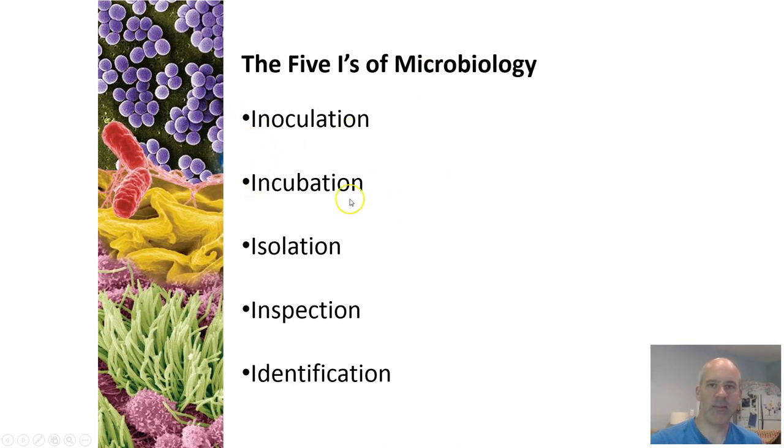Incubation. So you guys know what incubate means. You put it into some environment that's going to be with a proper temperature for that microorganism to grow. Then isolation. If you think about it, if you swabbed the inside of your mouth, there are going to be lots and lots of different types of microorganisms there. And isolation means you are separating out those different types of microorganisms so that you can study or identify them separately or independently. That's called isolation.